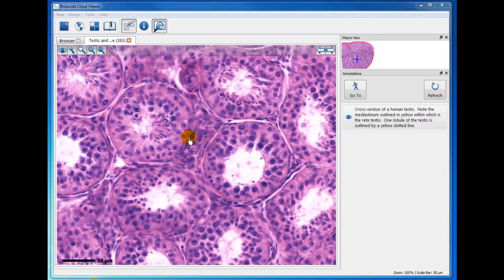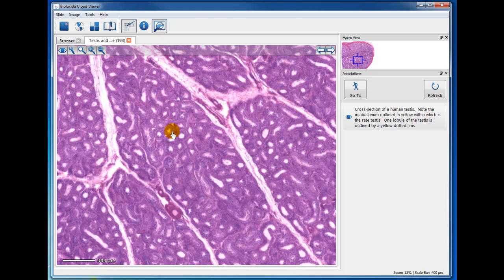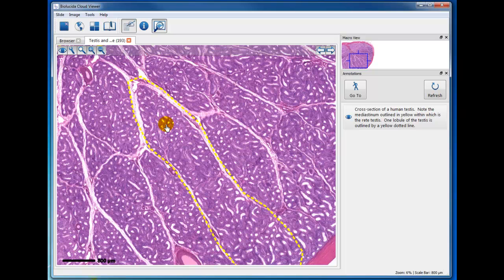And then if you go to other areas, which I'm going to pause and find some in a minute, like here's a cross section of a seminiferous tubule in which there are actually sperm that have formed. Now, all along these tubules, the formation of sperm is in different stages, and you can appreciate that if you go back to the lecture and see that over a 64-day period, the transformation takes place from the primary spermatocytes to secondary spermatocytes, spermatids, and then sperm. And it's your task to understand how these tubules are organized and what happens in those tubules.